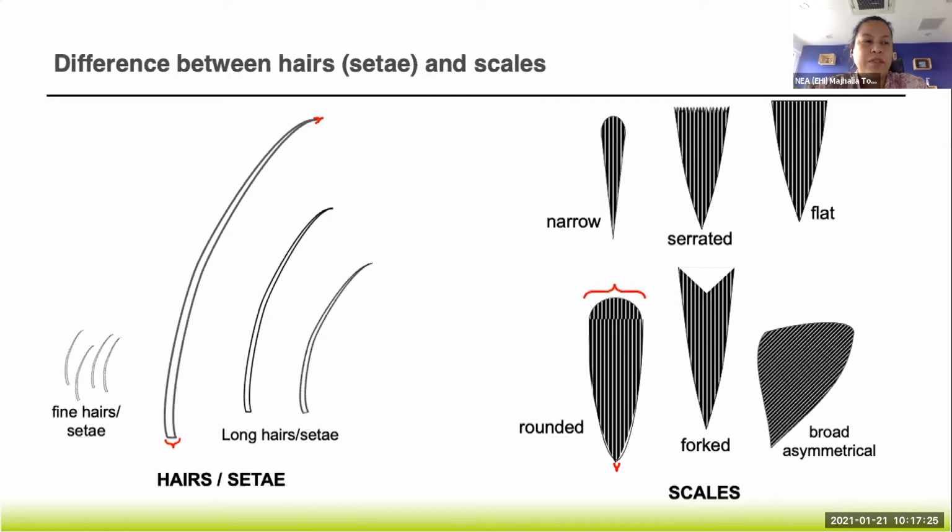Yes, we have differentiated the mosquitoes morphologically. And also, that is true. Wing venation is also characteristic of mosquitoes. It's just that when you want to zoom into species, it is more important to know the venation. But if you just want to know whether this is a mosquito or not, then the top three characteristics I've mentioned, which is the proboscis, the scales on the body and the legs, and on the wings, are the most important characteristics to determine them as mosquitoes.